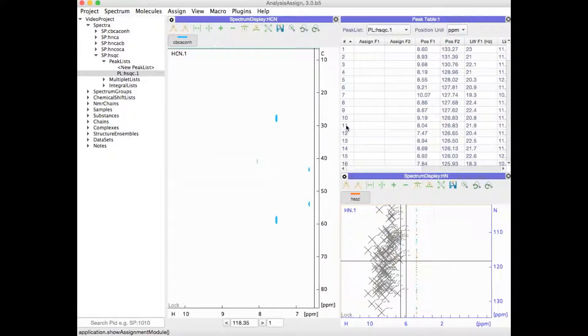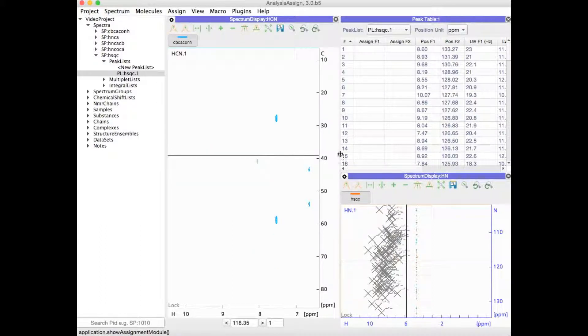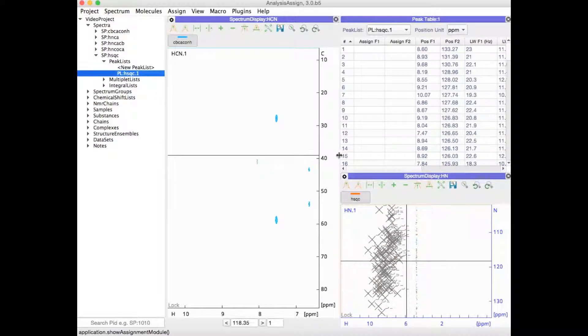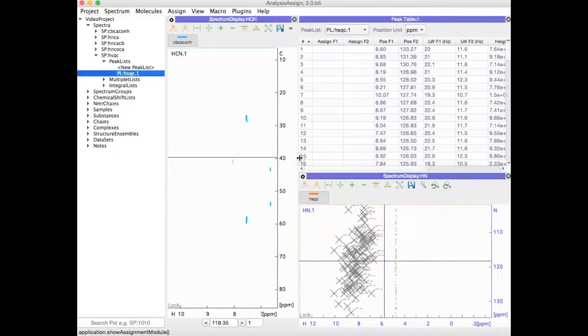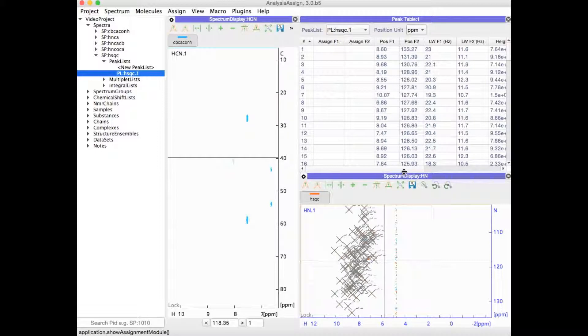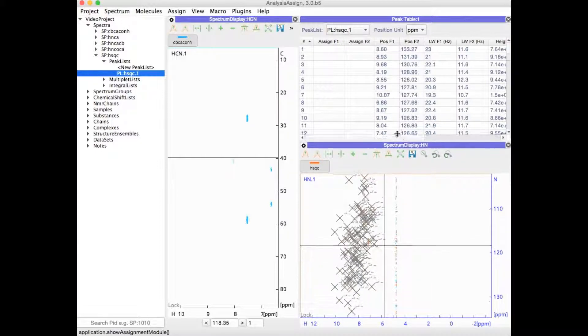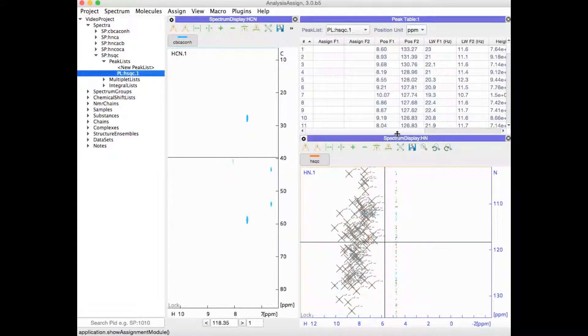You're also able to resize modules. If you go onto the edge between two modules, you can resize them dynamically as you would like.